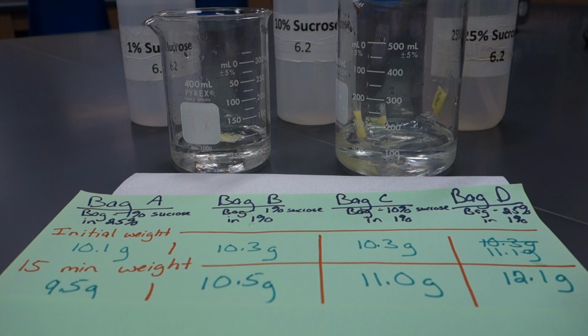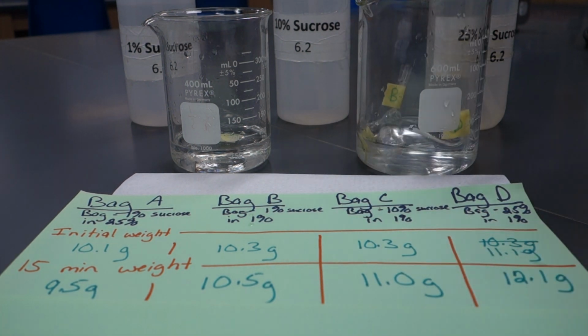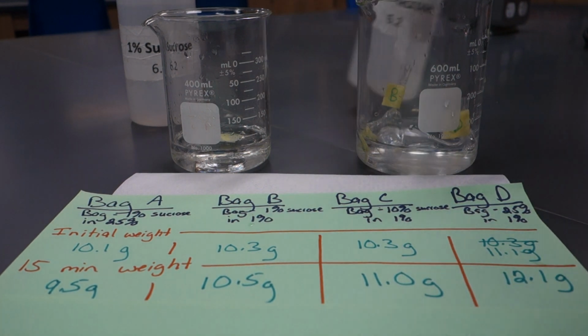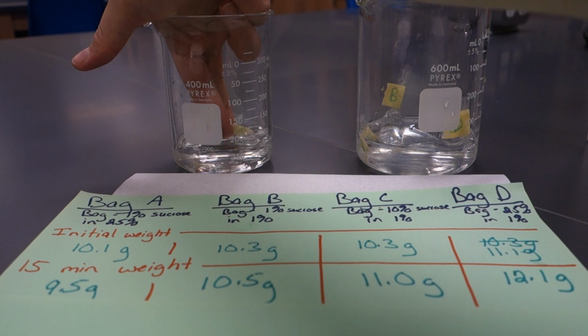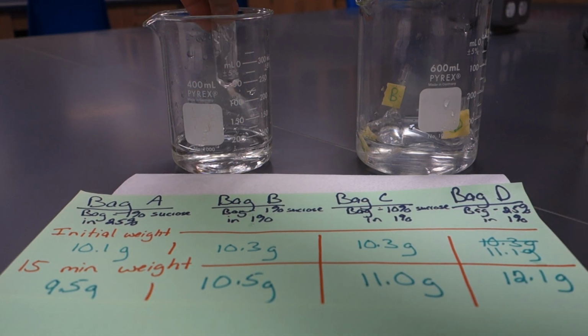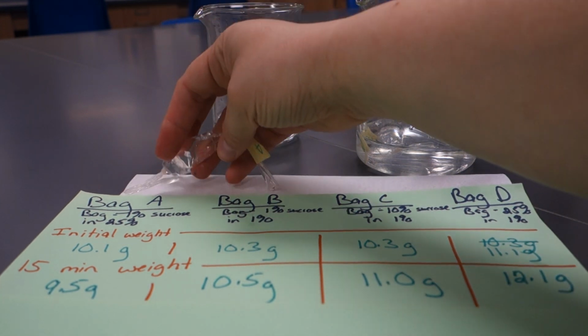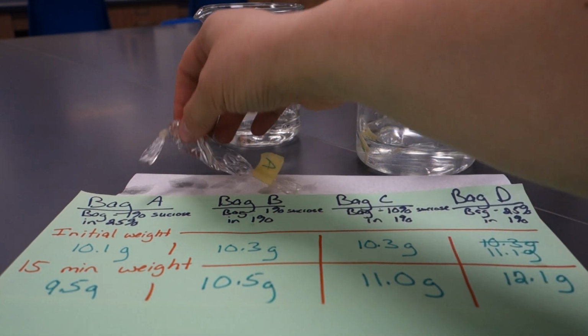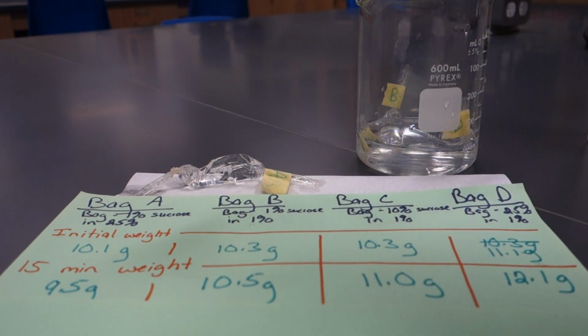Before I look at the rest of the data, one of the things I want to show you is what these bags actually look like. So let's get these out of the way. Bag A was sitting at 25%, right? So we were expecting, because it's sitting in a hypertonic solution, that it should lose weight. I want you to just look at what this bag looks like right now. Kind of floppy, right? It's not very firm. It's kind of lost all of its personality.